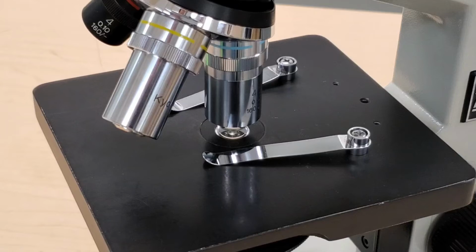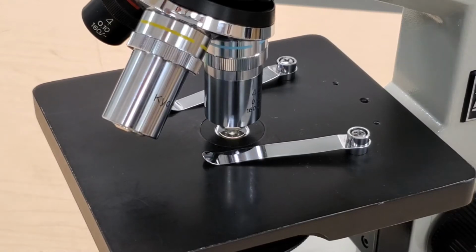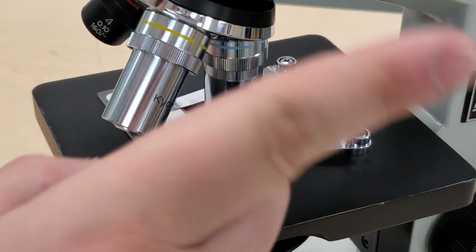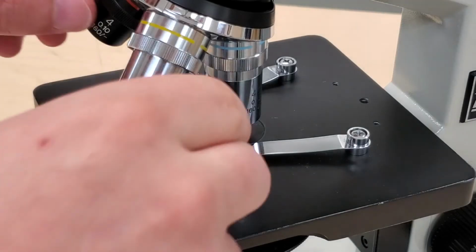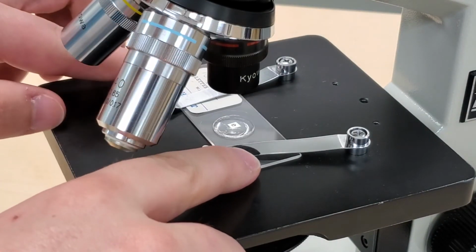Next, we need to place our sample on the stage so that we can see it properly. The stage clips help hold the sample in place. It's important to note that the lowest power objective lens should be pointing at the sample when the sample is first put on the stage. We don't want our sample slide to scratch the glass of the lenses, so we have to turn the revolving nose piece so that the lowest power or the smallest objective lens is pointed at our sample.